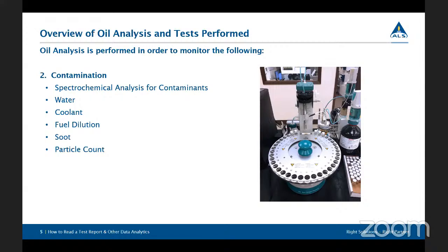That's how we test water. What we do is we titrate in an iodine solution and we look at a reaction with the water that's possibly in that sample to determine what that concentration of water is. And we utilize ovens to separate the water from the lubricant. So if that water has gotten into that oil, we need a way to pull that water out, and heat is a really good way to do that. So we'll put it into a vessel, heat it up, pull that water out, and then that vapor goes into a chamber that we then titrate.